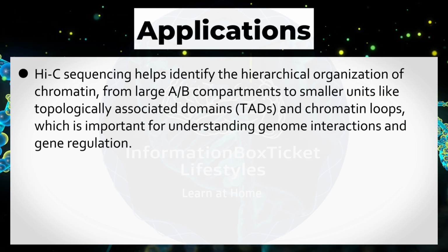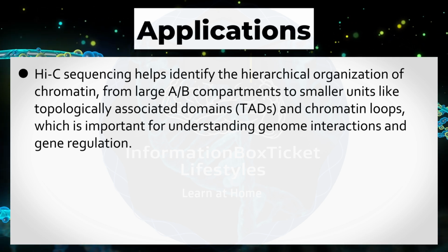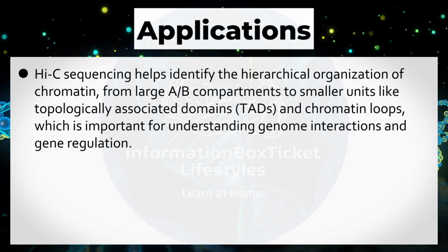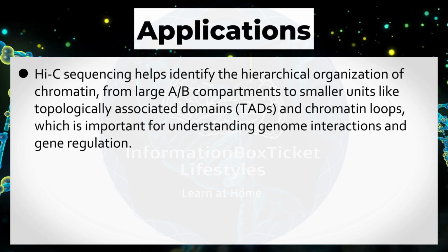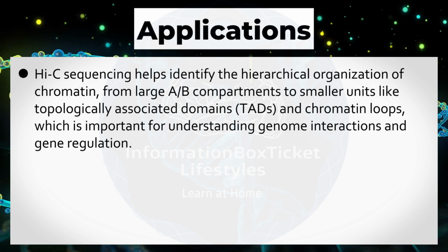Hi-C sequencing helps identify the hierarchical organization of chromatin, from large A/B compartments to smaller units like topologically associated domains, TADs, and chromatin loops, which is important for understanding genome interactions and gene regulation.